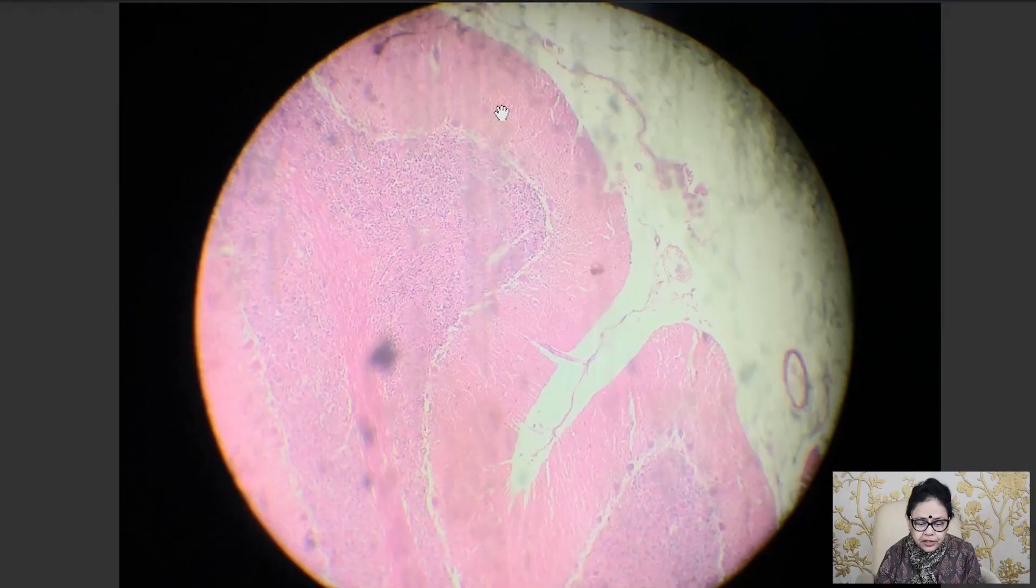Now I shall discuss how you will identify the slide of cerebellum under the microscope.